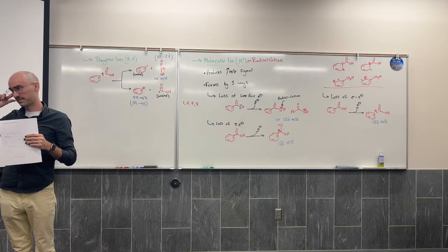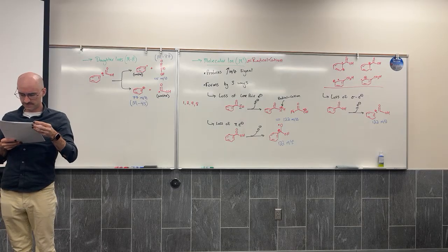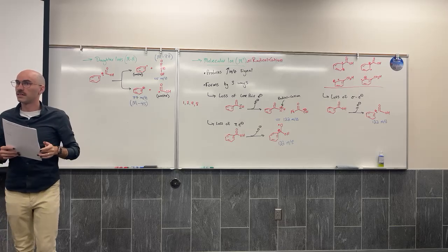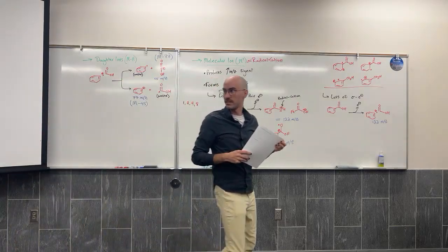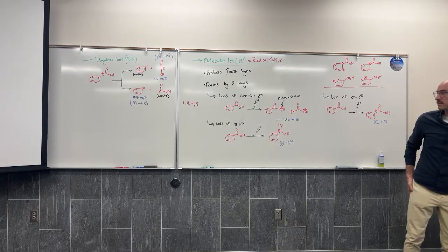No. Oh, that's because it's 105, which is a loss of 122 to 105 is a loss of 17. And you know what weighs 17? OH.